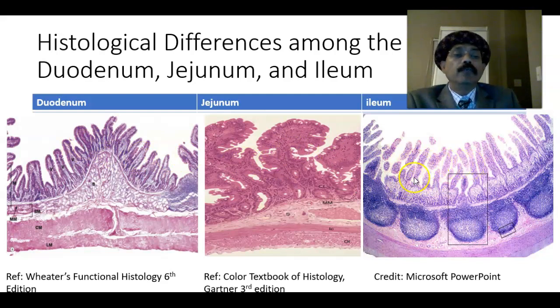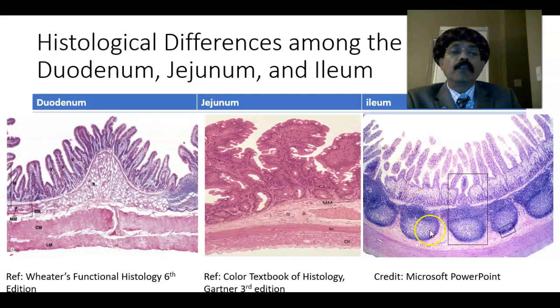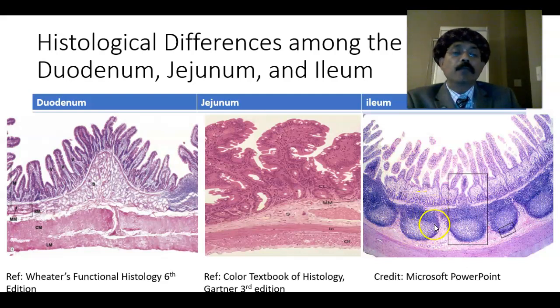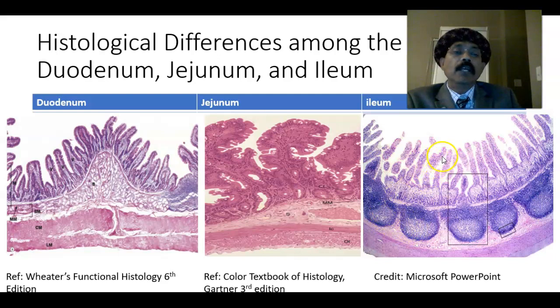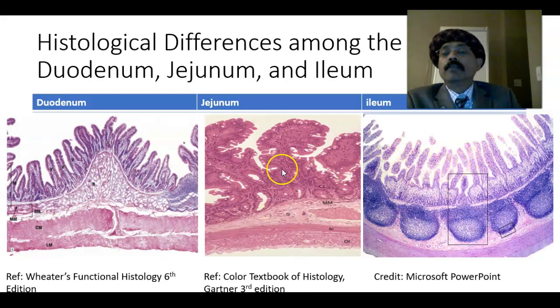The number of goblet cells is more in the jejunum than in the duodenum. If you compare this with the ileum, we will find submucosal lymphatic nodules — we call them Peyer's patches. They are present in the lamina propria and may extend into the submucosa. These lymphatic nodules have a germinal center — the light area — and the villi are the shortest and the goblet cell count is highest in the ileum.